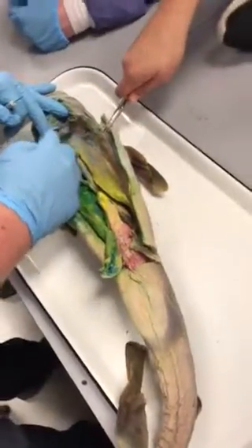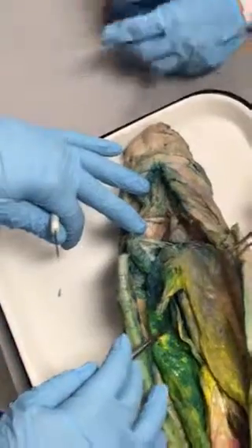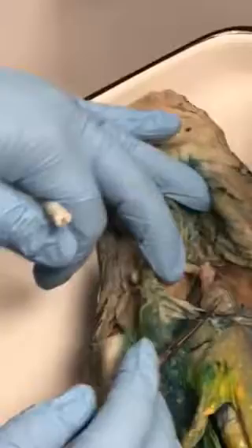Too, but this is darker, that's the atrium. Okay. Sinus venosus. Yeah, there's only one of each, right? In the sinus venosus chart. Right, there's only one of these, one atrium and one ventricle. That's why I said it looks like two. It's there. You can see it.